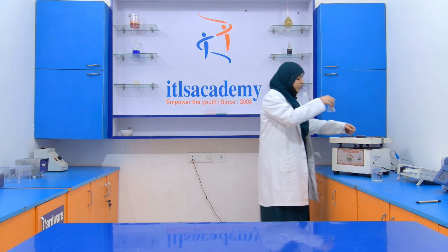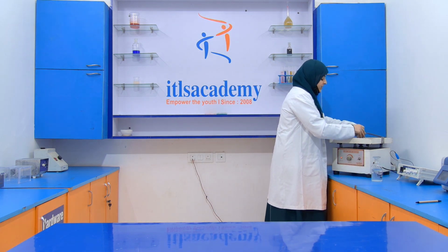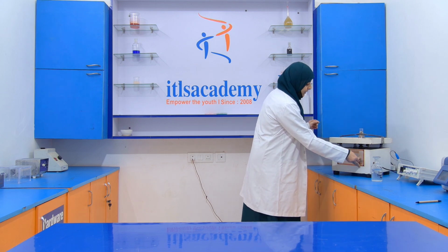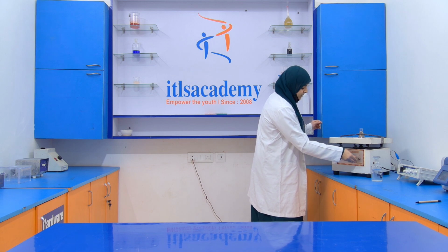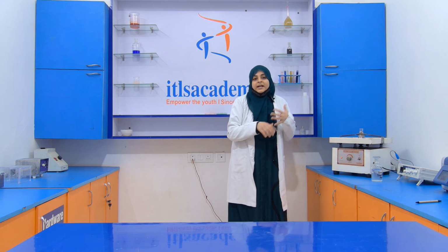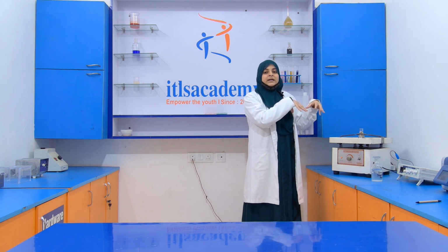Now I am going to put this conical flask into the shaker and start the shaker, and it should continue rotating on the shaker.